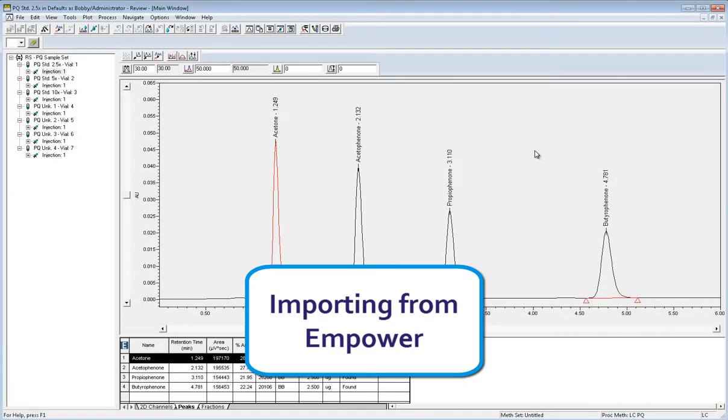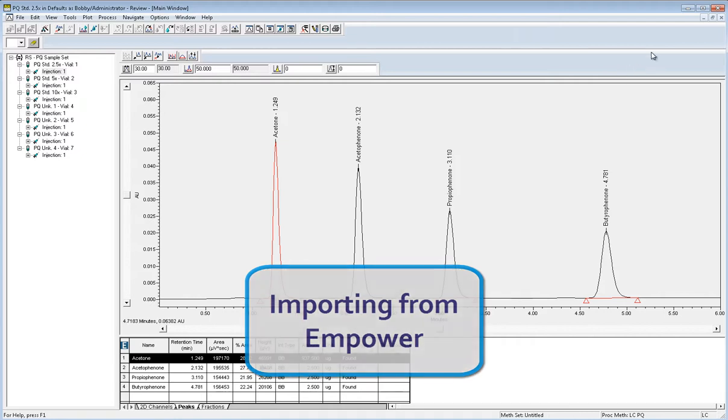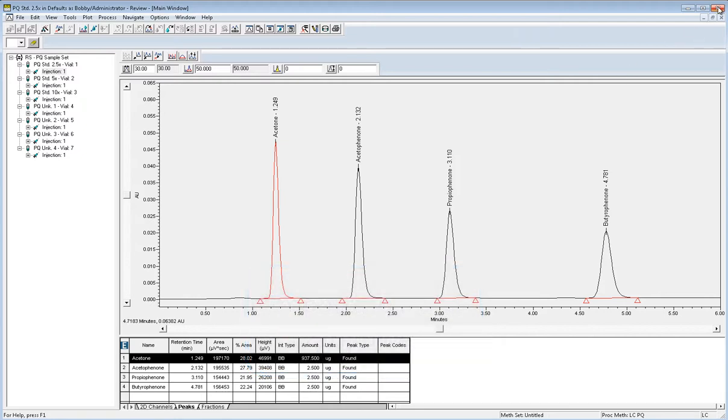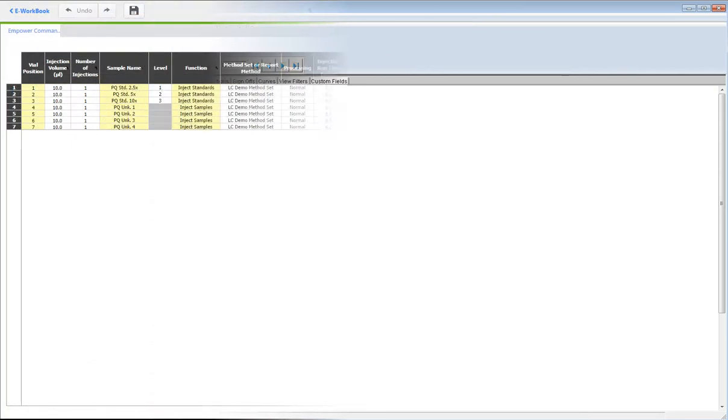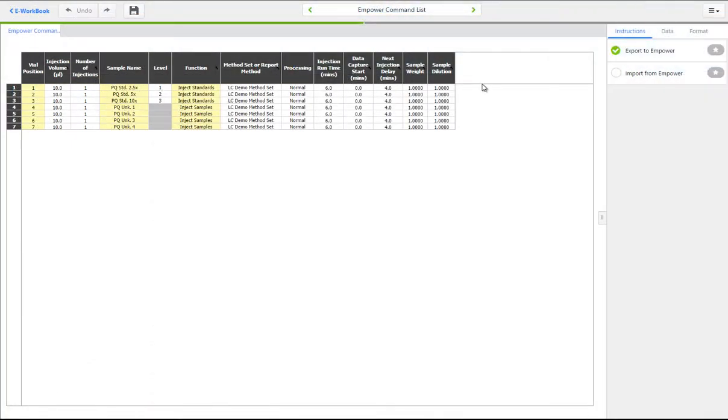Once you have completed your data analysis in mPower, the result data can be imported back into your eWorkbook spreadsheets, allowing you to associate it with your sample preparation information.